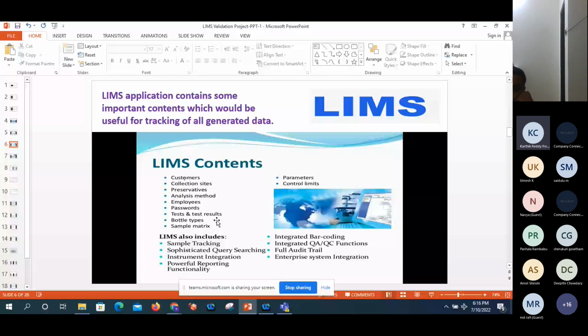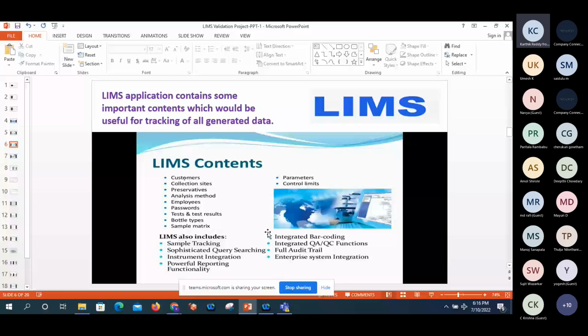Once review is completed by QA or QC, a tick mark appears, and these indicators show on conical flasks. Sample matrix is also available. How many samples are generated can be easily managed here, and anybody can easily understand the sample number. There are unique sample numbers, unique lot numbers, and unique inventory ID numbers for whatever samples are generated, so there is no mixing of things.